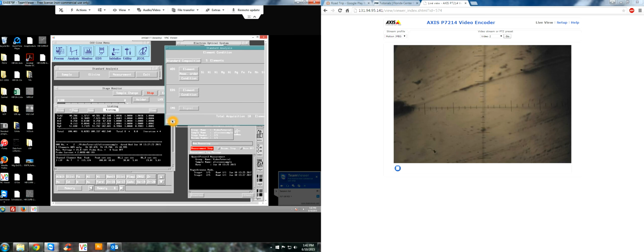So let's close this. You can hit OK. Don't change those numbers. Hit close, and then standard analysis and exit. And I'll meet you when the measurement's over. We'll see you on the rebound.